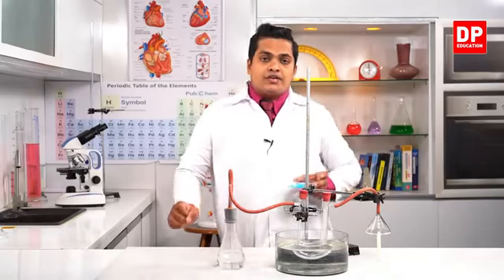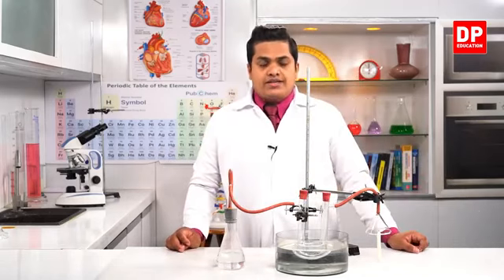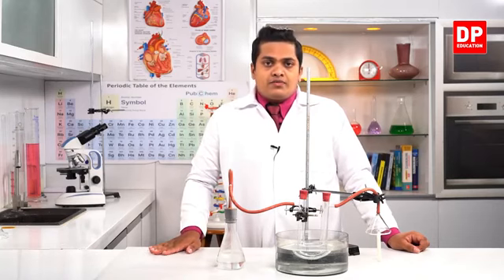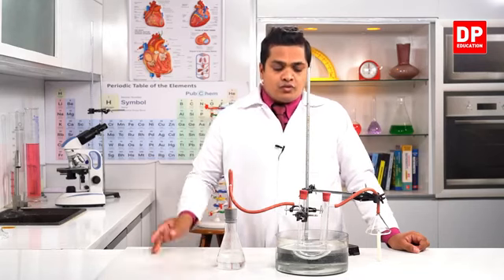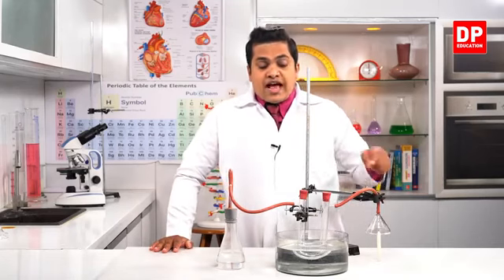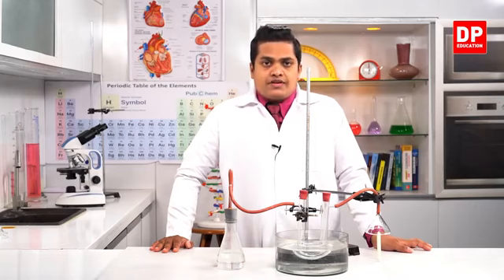So anhydrous copper sulfate means, after heating, you can take some amount of blue color copper sulfate and heat it. When you heat copper sulfate, the water vapor absorbed in the crystals gets evaporated, and the crystals turn into a white color like this, which is in the U tube. So this is anhydrous copper sulfate, which I have prepared by heating hydrous copper sulfate.